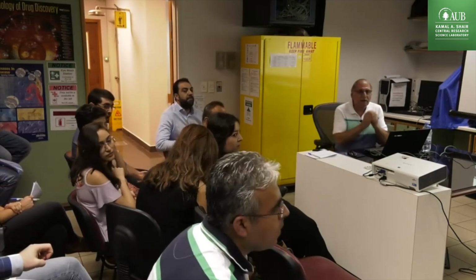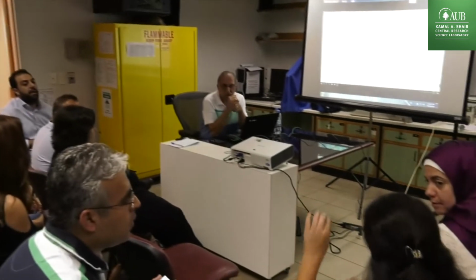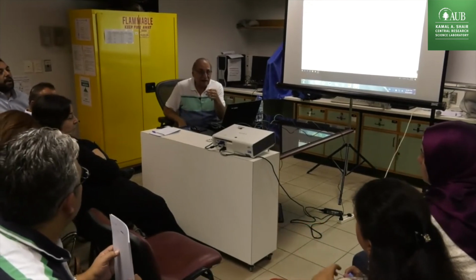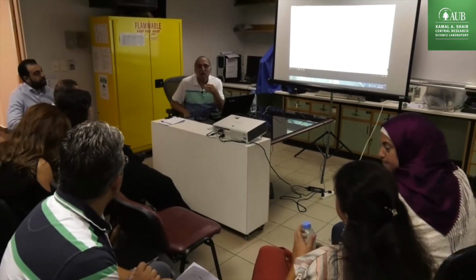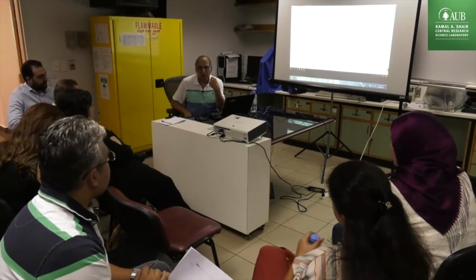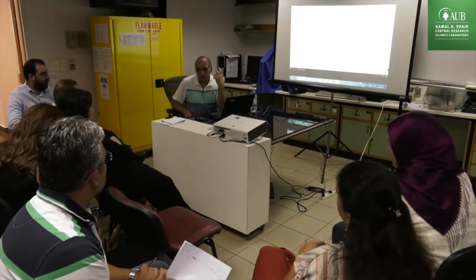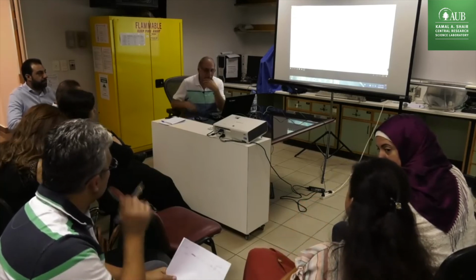Okay, I have a cell that doesn't have a bulb. Doesn't matter, it's a thin one. That's okay, I can use it, no problem. The thickness of the rod doesn't matter as long as the O-rings fit around it. So we don't have a leak. You can test it empty. You put the O-ring there and you apply a vacuum to it for maybe 10 or 15 minutes. You close the vacuum and see if it's holding the vacuum or not. If it's holding, no problem. It's the same diameter, 12 millimeters. It will be okay.